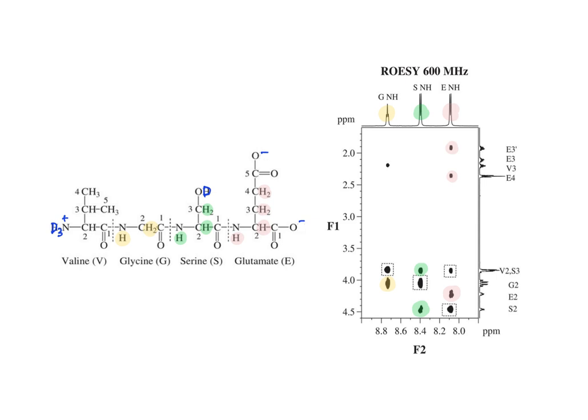For the glycine NH, there is now a new correlation with the hydrogen for valine. It does happen to overlap with serine hydrogens, but upon magnification, this can be detected in the primary spectrum. And there's also a through space correlation with the 3 hydrogen of valine.